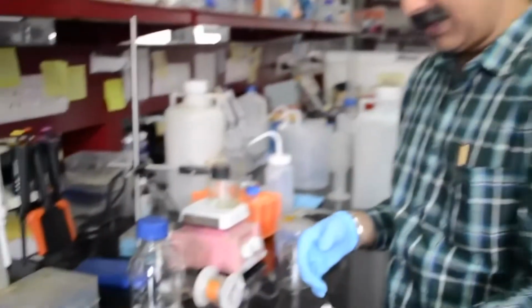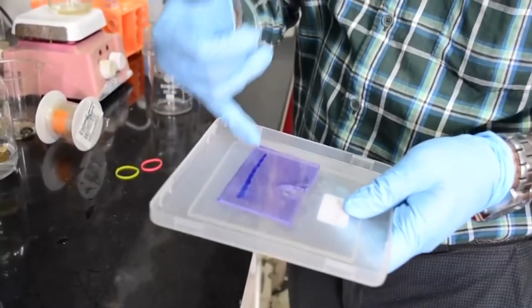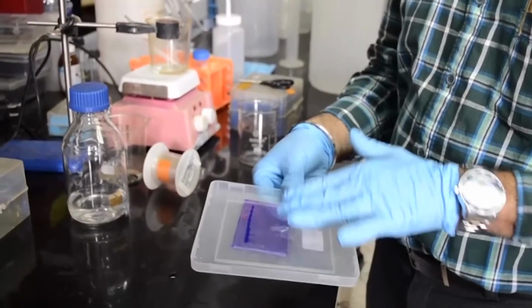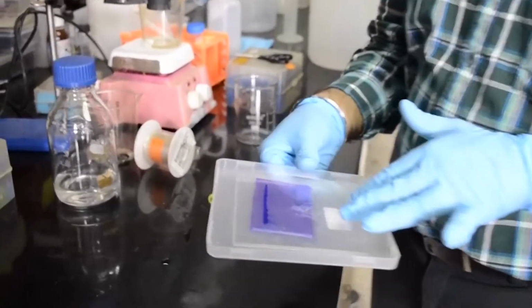Electroelution is a technique through which you can isolate an antigen from an SDS page. You can see this is a typical SDS page from which we are interested in isolating this particular band. In ideal situations, you are supposed to not stain these gels, but since we are just showing it for demo purposes, we are going to show you with this particular gel.